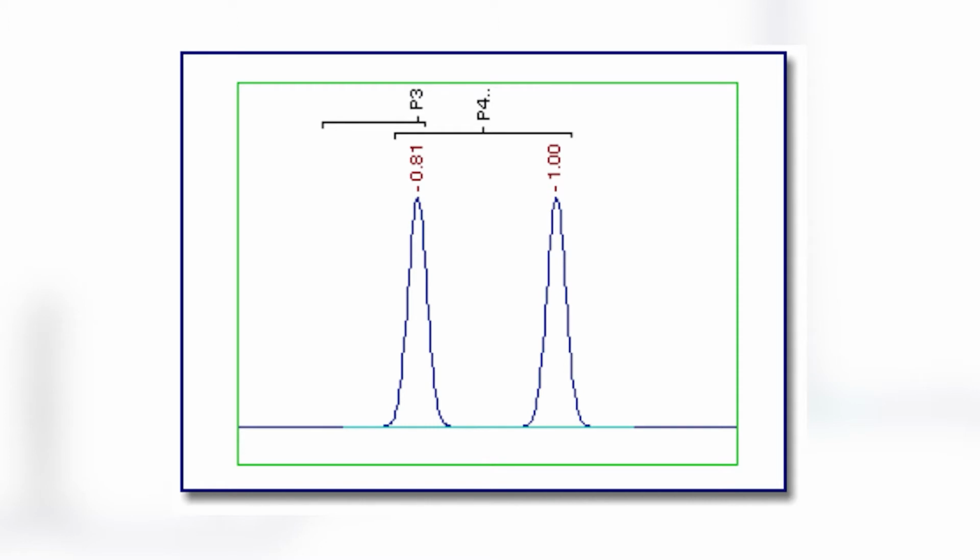Each component gets only one chance to find a peak. If a peak is tentatively assigned to more than one component, then the component that loses that peak will have no peak at all assigned to it, even if there was another peak under that window. The following figure illustrates this problem.